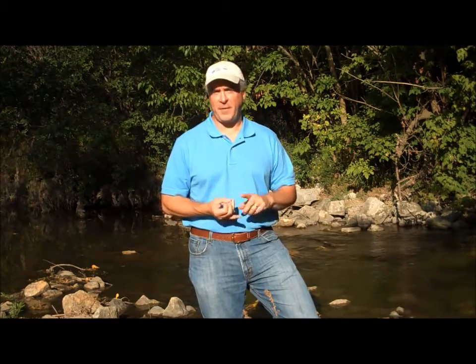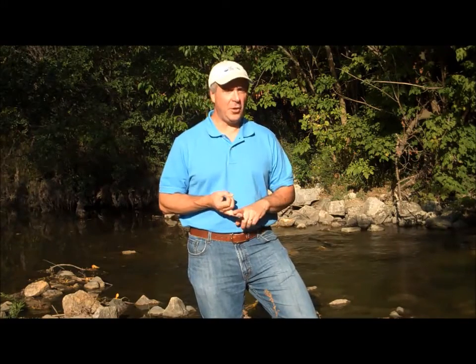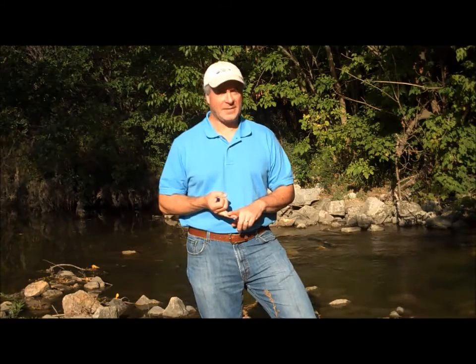The reason why we collect data here at the river is not only to learn how to become a scientist, but also to share our data with the Friends of the Chicago River and with the Illinois Rivers Project at Southern Illinois University. These particular groups want data from this stretch of the river to know its overall health. So you're doing real science, and you need to be able to do the tests as well as possible.